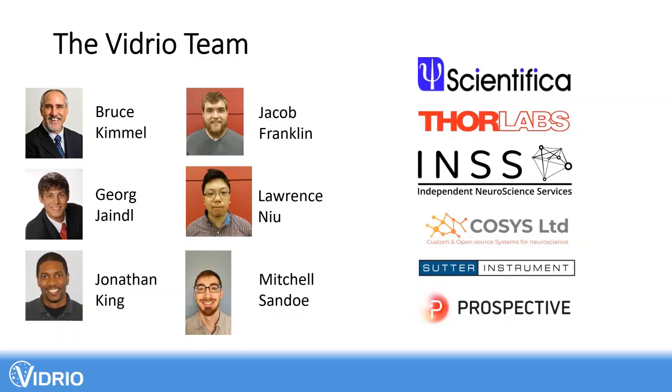And I wanted to highlight there's a new microscope company out there, Prospective, that might be interesting. They're trying to go on the clinical side, and they've got a laser integrated into the scan head. So it may not be good for the cutting edge, but it might be interesting on the clinical side.